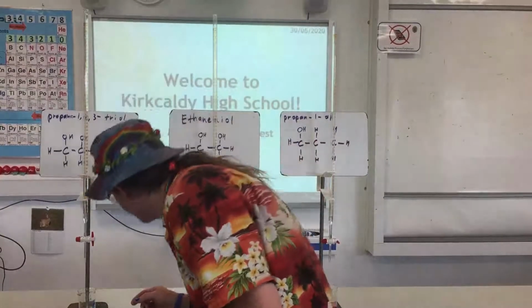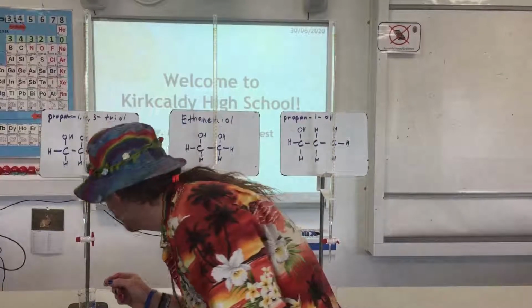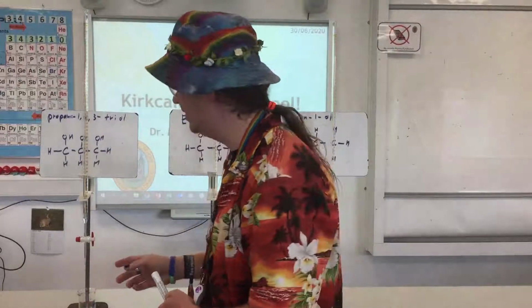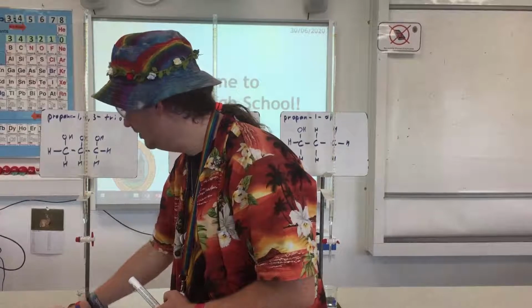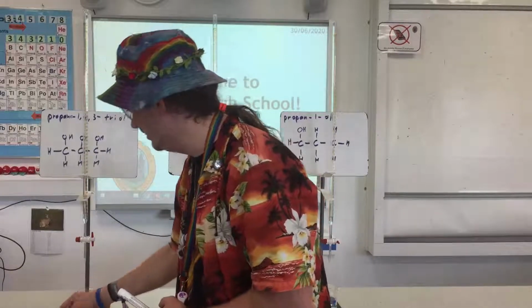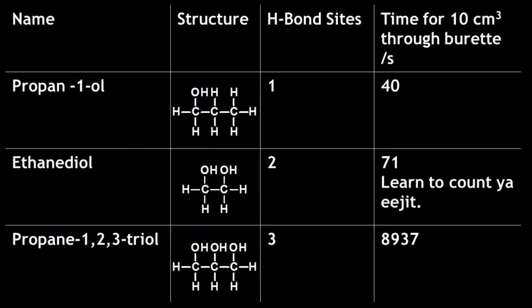The anticipation is truly killing me. And we're just about there. And it's in 3, 2, 1, stopping the clock. So previously on 97 minutes because I had to reset my timer a few times. So that's 97 minutes. I'm adding on 51 minutes onto that, which is what's on the timer at the moment. I'm going to multiply that by 60 to get the number of seconds, and I'm going to add on another 57 seconds, which is also on the timer. 8,937 seconds on this particular one.